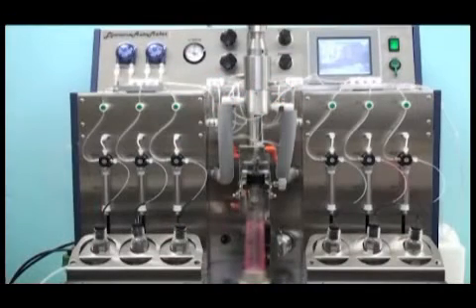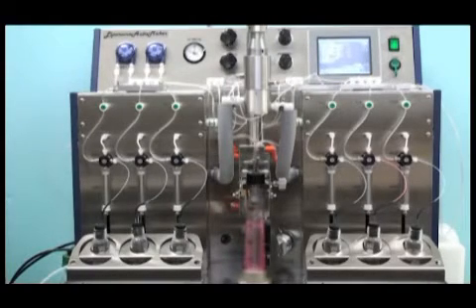New from Hashimoto Electronic Industry Company Limited, the liposome automaker is the world's first automated liposome manufacturing system.